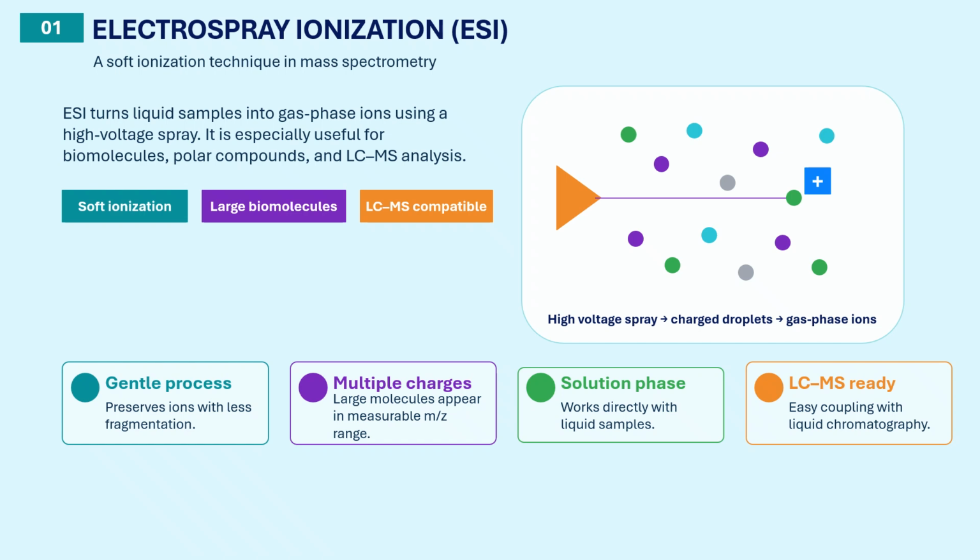One major advantage of ESI is that it works directly with solution phase samples. That means it can be easily combined with liquid chromatography, also called LCMS. This is why ESI is widely used in modern analytical chemistry, pharmaceutical analysis, biochemistry, and proteomics.